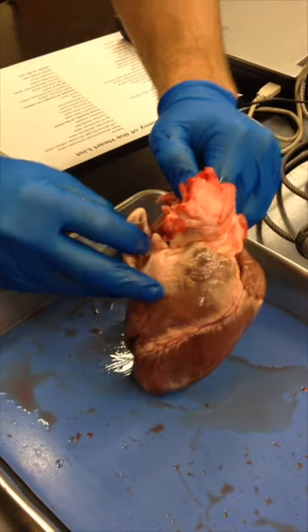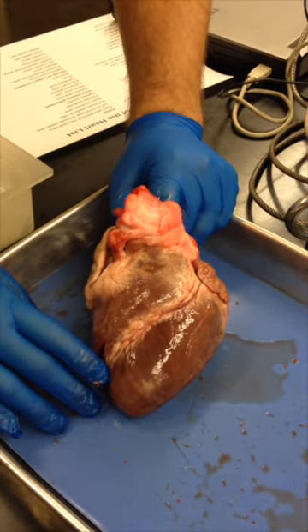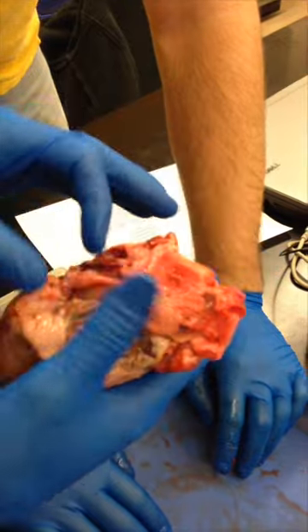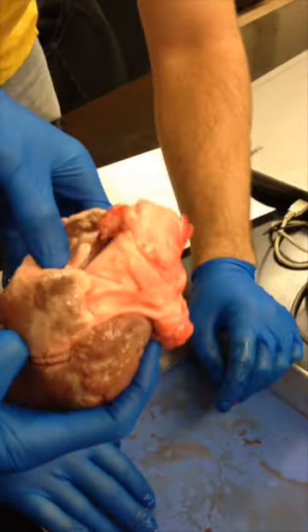In the right atrium. Now, there are veins, so they're going to be much thinner and floppier than these big, thick-walled arteries. Oh, okay. You squish that and it just springs right back, right? And so this is the right side. Your right atrium is going to be up here.